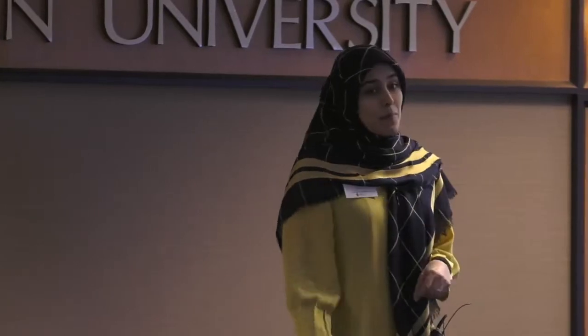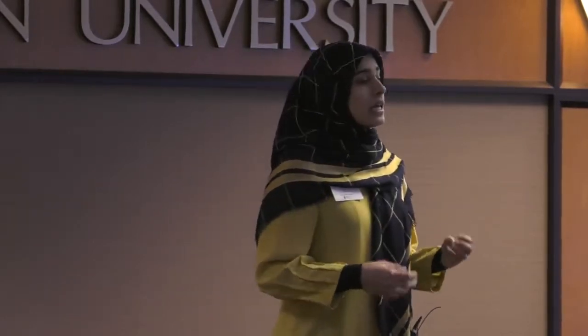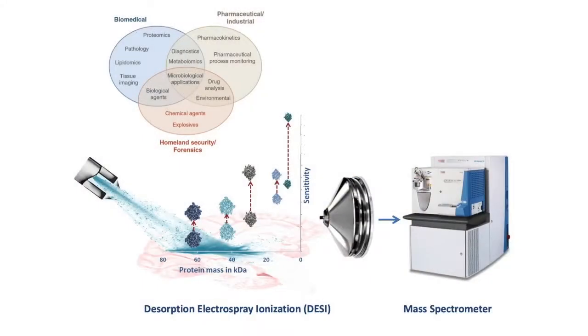To prepare a sample for electrospray ionization, we usually have to blend it and then extract it. And after hours of processing, the sample, which is now in the form of a solution, is ready to be injected into a mass spectrometer. A recent extension of electrospray ionization allows this method to be used to analyze molecules from surfaces directly. So no solution, no long time for processing.